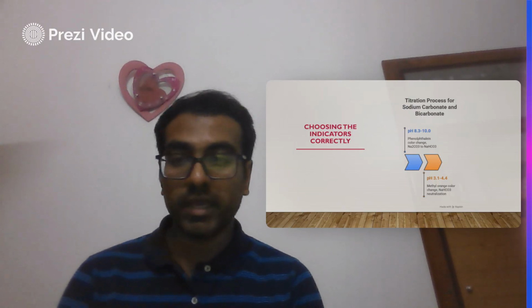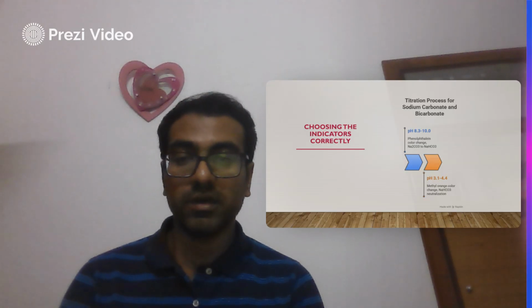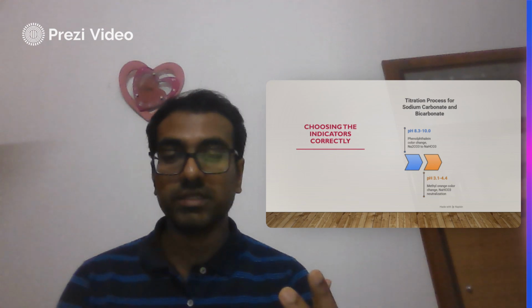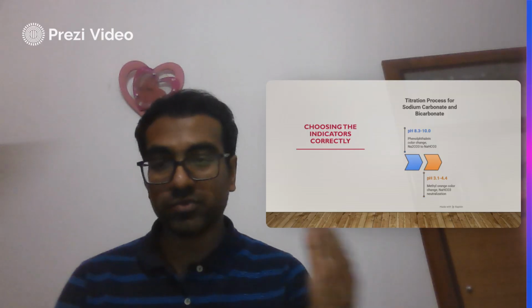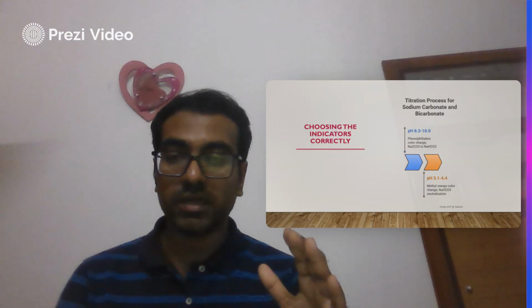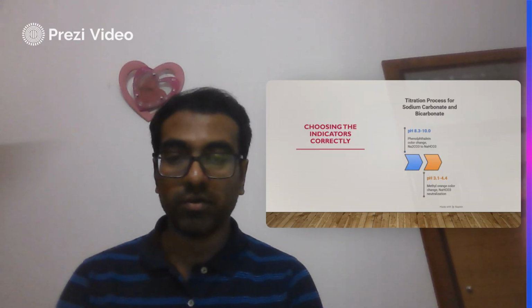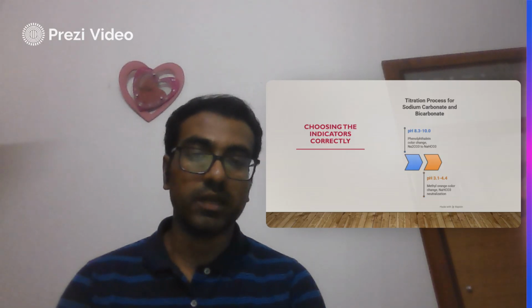What is the color change? Again, I would mention, in the acid medium, the methyl orange indicator would show a reddish orange color, right? And as soon as we get to the end point, the color would change to pale yellow, right? So that is why you have to be very careful when choosing your indicator, right?